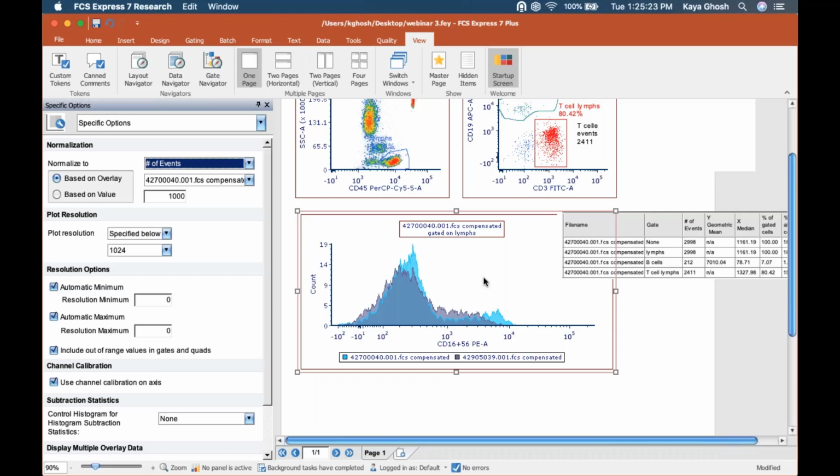And all these things I'm showing you, like the smoothing, the colors, the normalizations, are all things you can set up in your default user options as well. That way you won't have to do it one by one, or every time you design a new layout. You can just by default have smoothing applied and legends and all that. I'm not going to show you step by step how to do that, but I'll get you to the right spot.